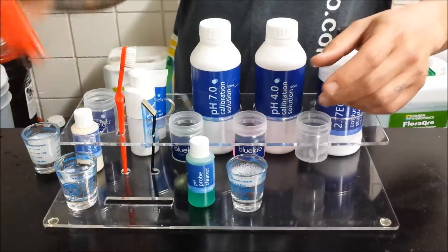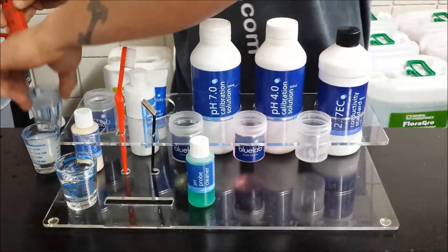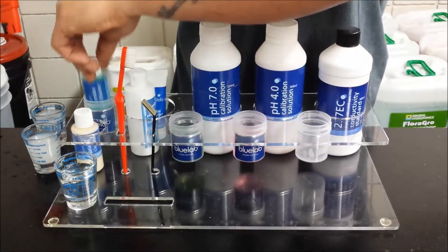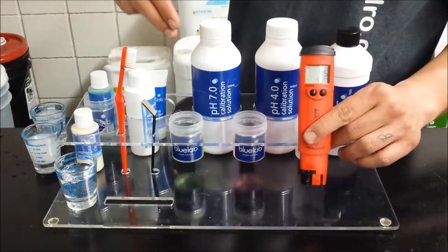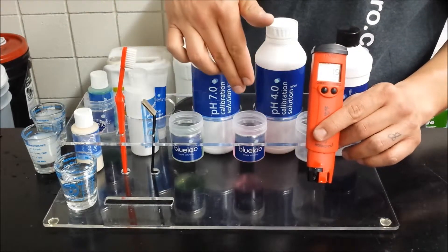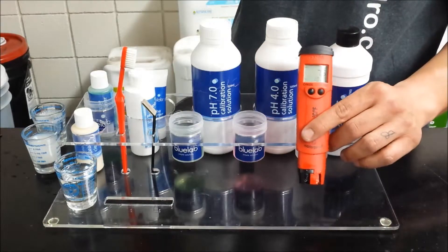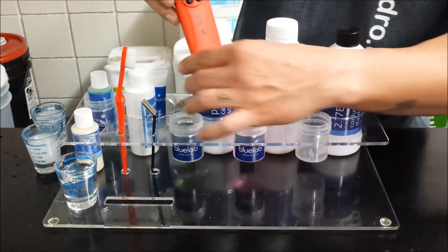Go ahead and rinse it off in some water. Now you're ready to calibrate. You want to start with fresh calibration solution. So we have some 7.0 and 4.0 pH calibration solution here. Start with the 7.0.